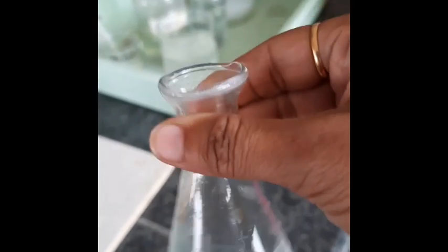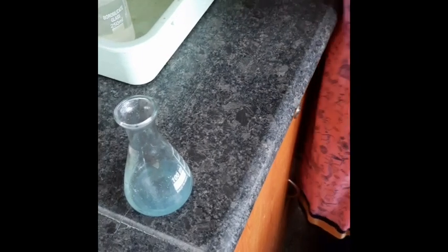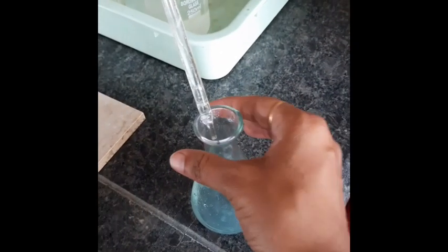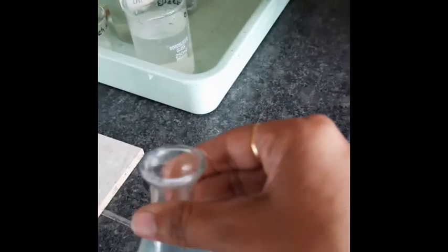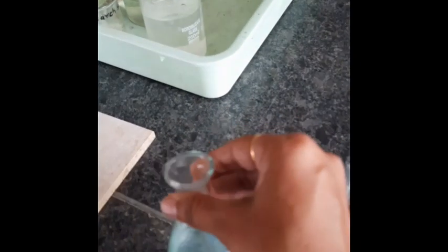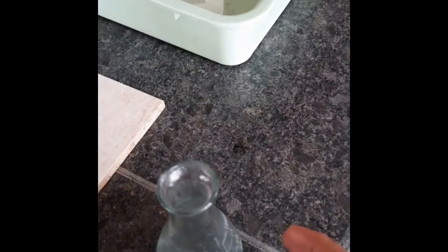Now you have to add acetic acid dropwise with constant stirring till that turbidity dissolves. I'm adding the acetic acid with constant stirring till that precipitate dissolves. Now a few more drops are needed. I'm adding a few more acetic acid dropwise. Now the precipitate is dissolved completely.